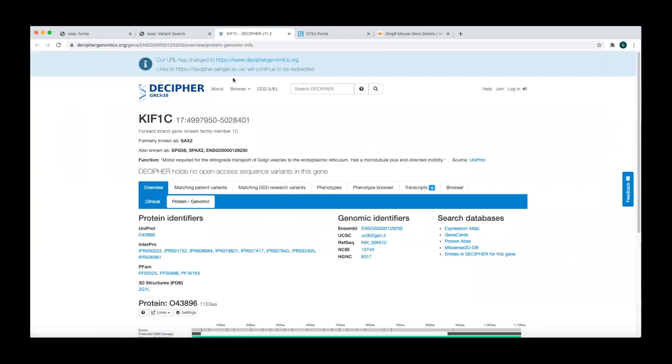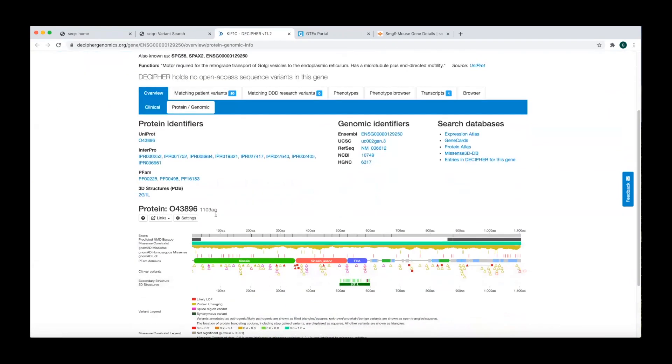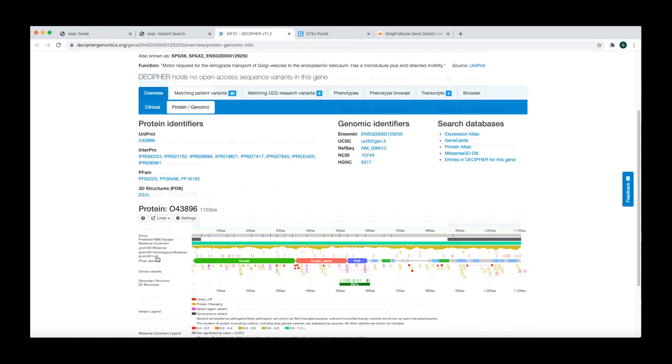Clicking on the Decipher link will bring you to the Decipher entry associated with the gene. The Protein Genomic tab displays a figure that is particularly useful to visualize clinical variants, ClinVar variants, functional domains, and the distribution of missense and loss of function variants in gnomAD.